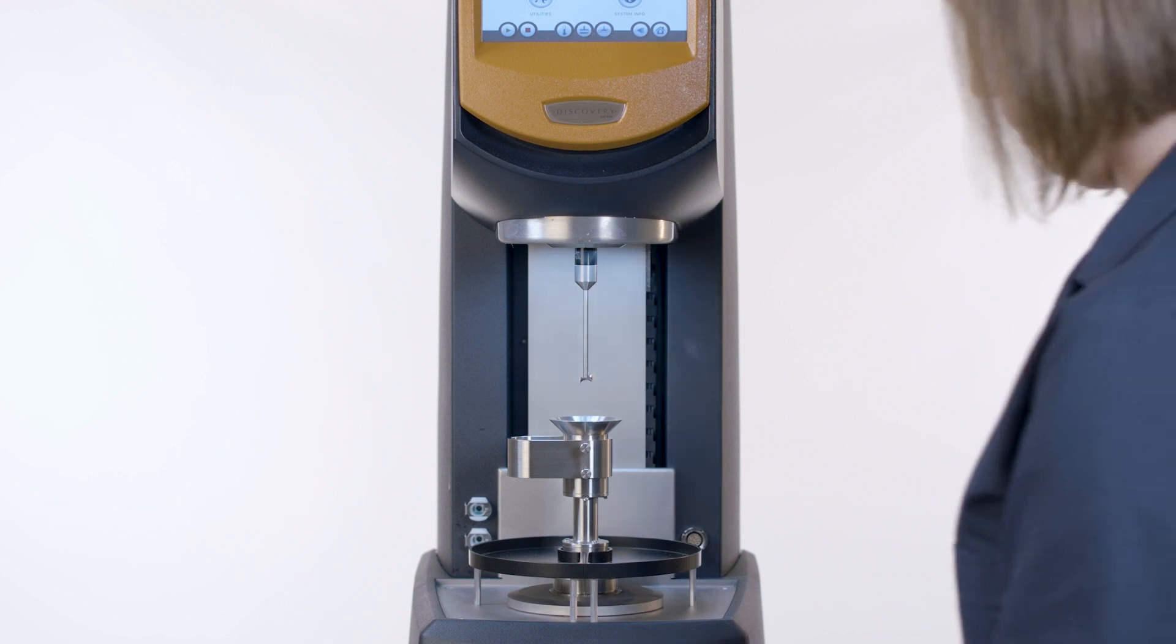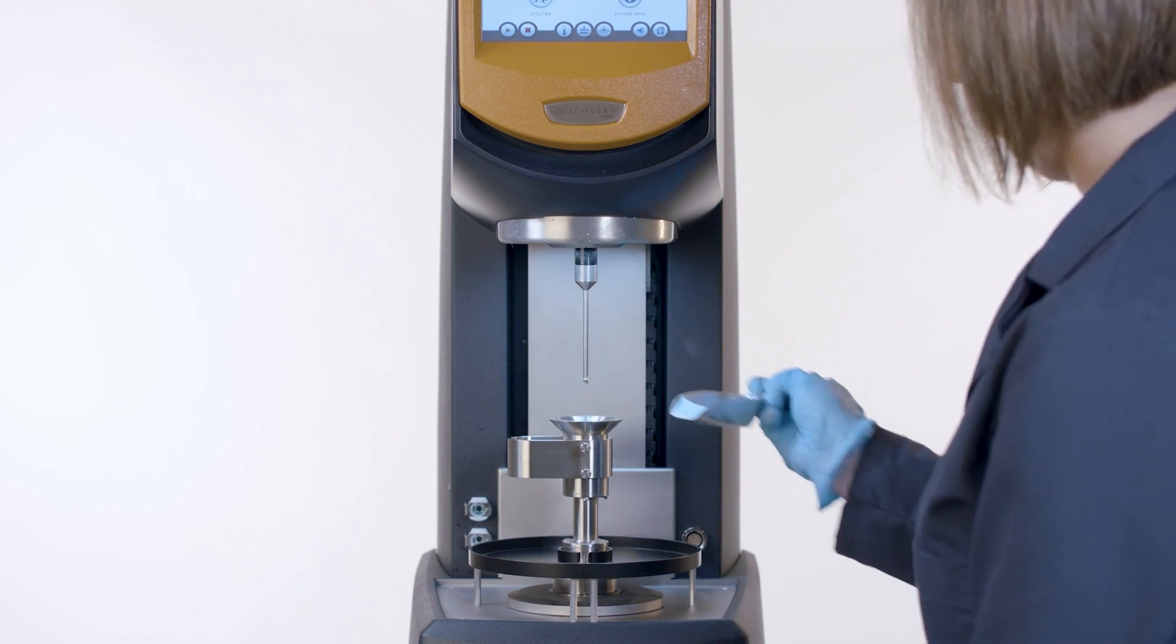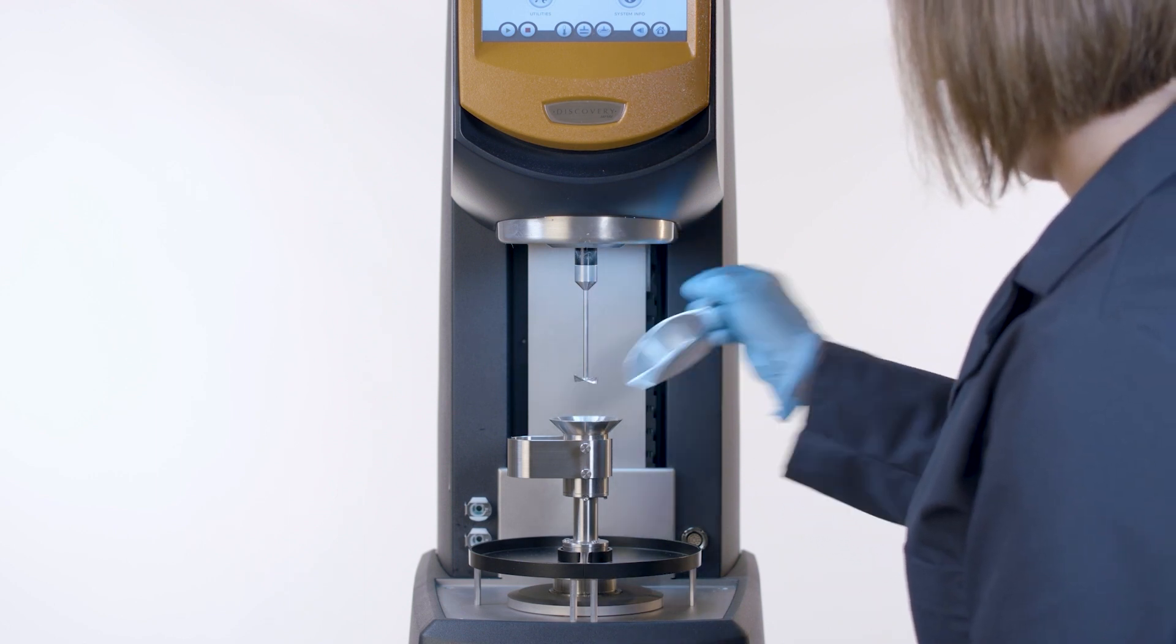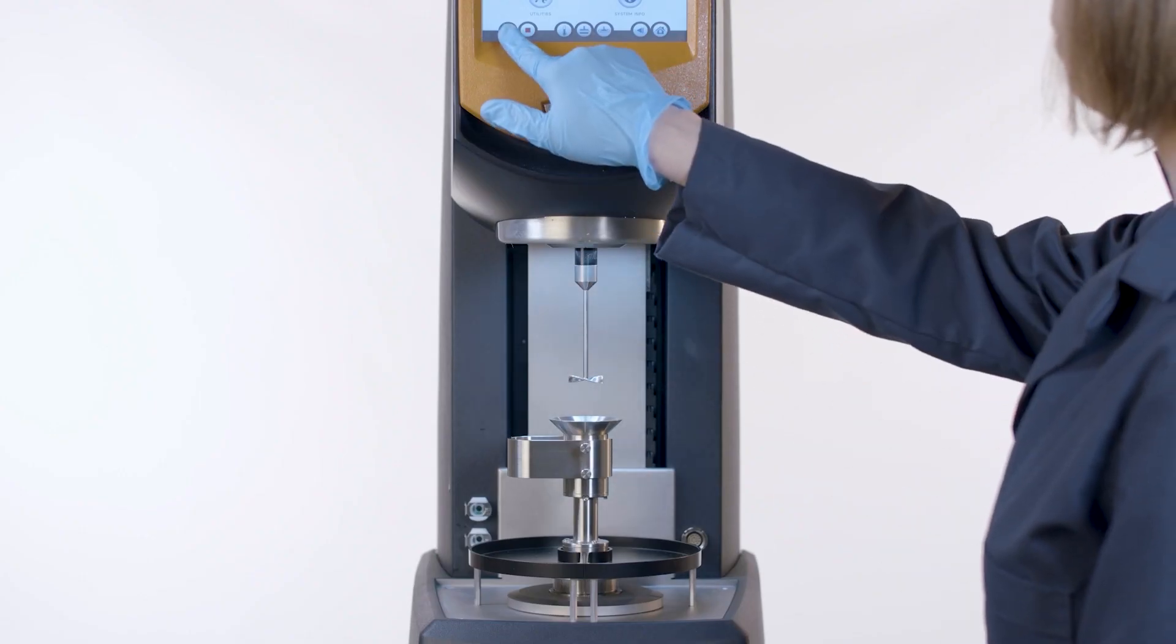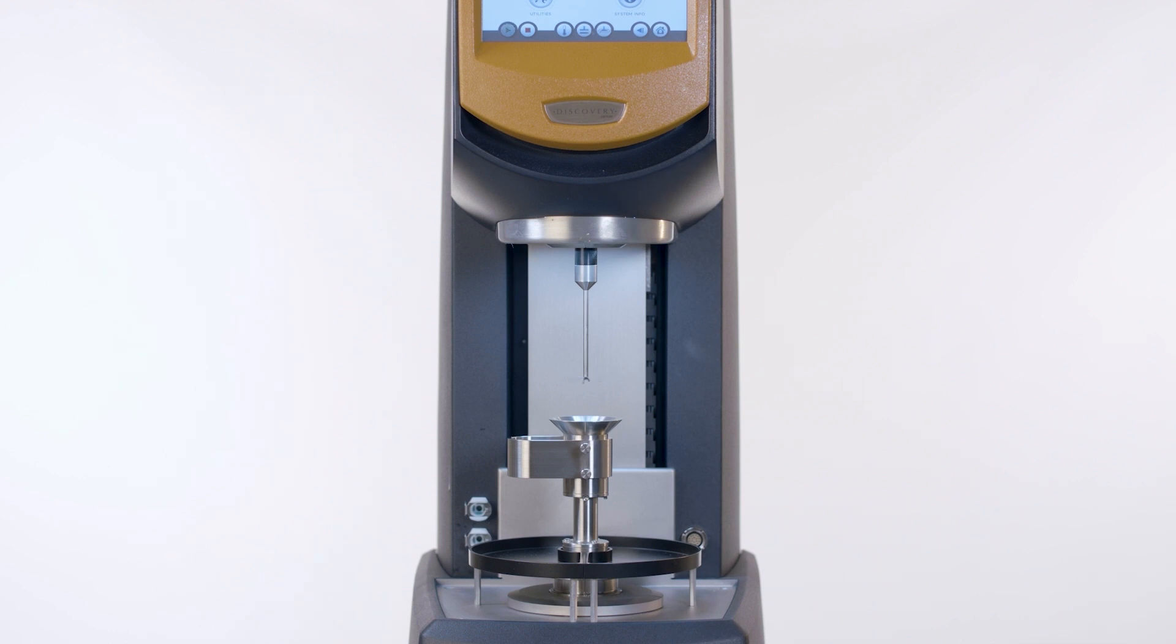Powder is loaded into the cell above the cup, but below the top neck of the funnel, thus ensuring that the powder is neither under-filled nor over-filled. Start the test from the instrument or from the software.